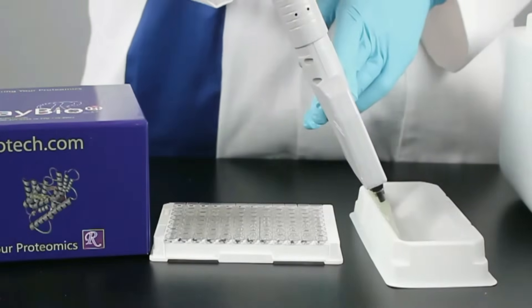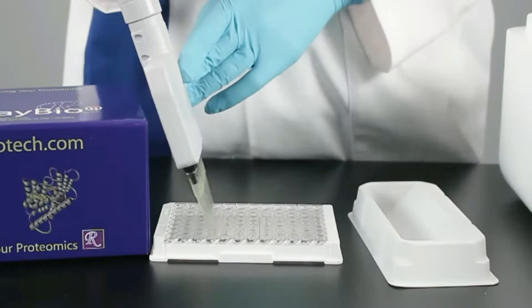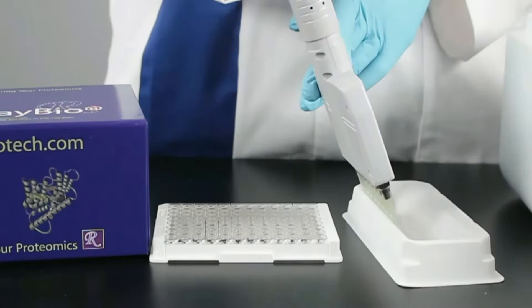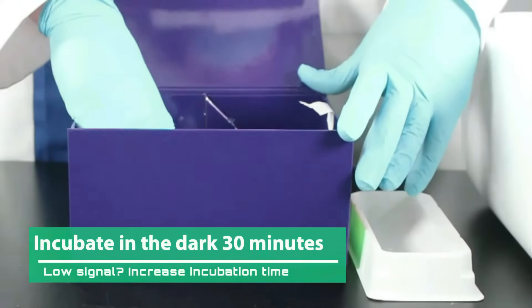This is a light sensitive reaction, so you will incubate in the dark for 30 minutes. If you have low signal, increase the incubation time.